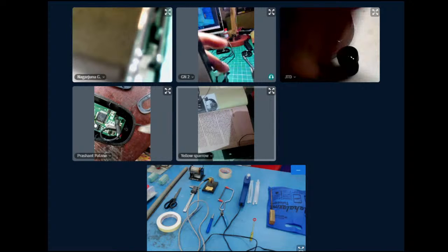Okay, so I'm removing the cover of this lens. I have to unscrew this so that this whole thing is removed. Now when I unscrew it, the result is what you see on the left hand side in the other camera, which is the original camera, that is Nagarjunaji. The camera that I've dismantled is connected to the online feed right now.